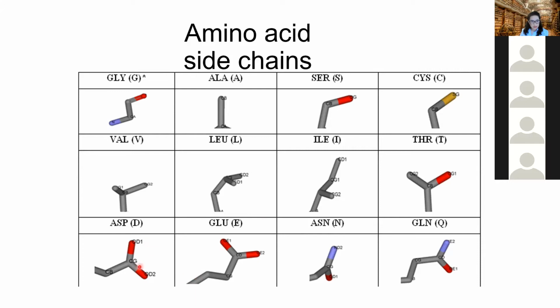For aspartate and glutamate, they have a double bond O and OH. So in electron density, they look the same, but basically this one is double bond O and OH. And if it has 2 red tips, if it has 2 reds, it's a negative charge. So it's partial negative charge. The partial negative charge allows it to form salt bridge with partial positive charge. So if it's red, it forms salt bridge with the blue colors.